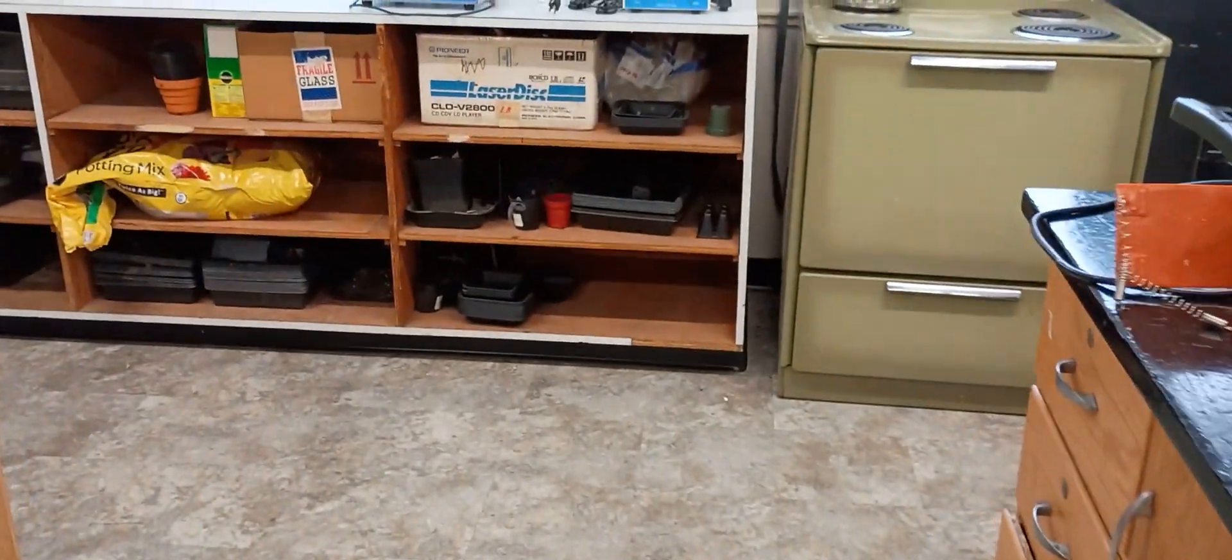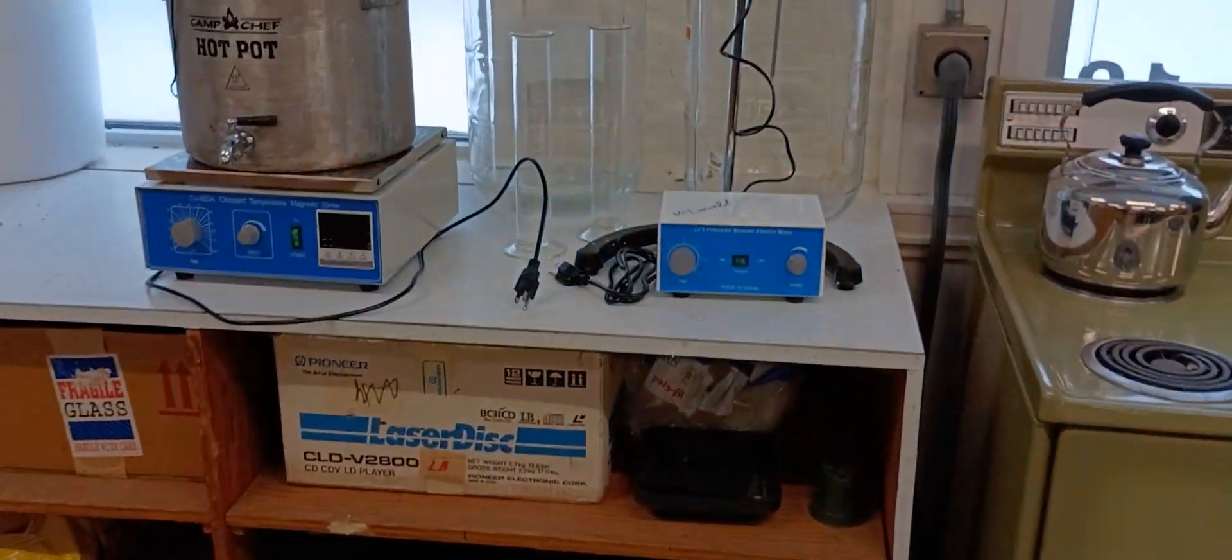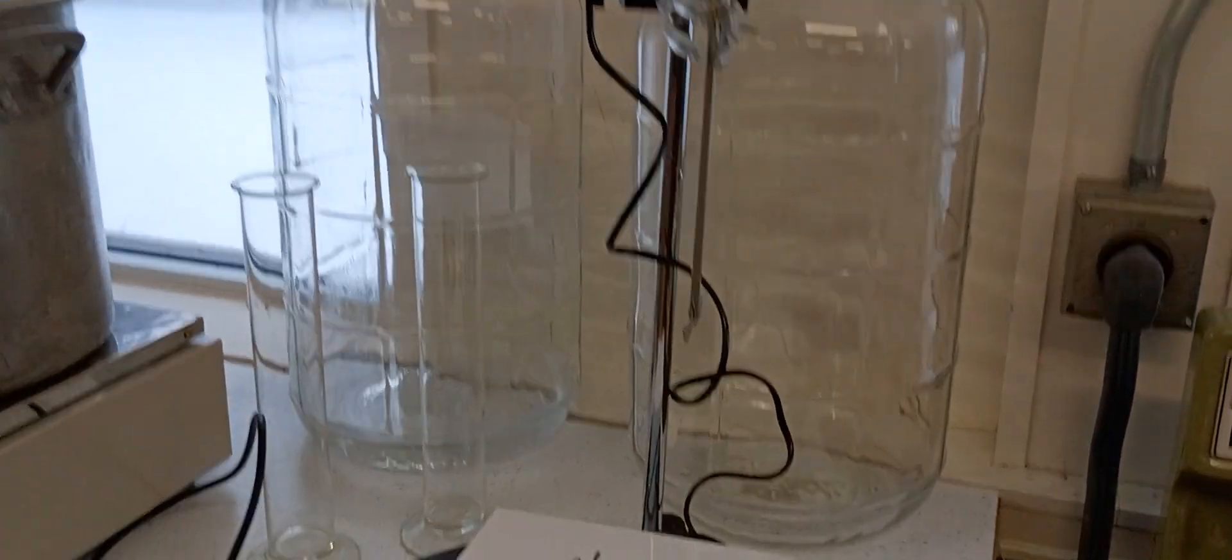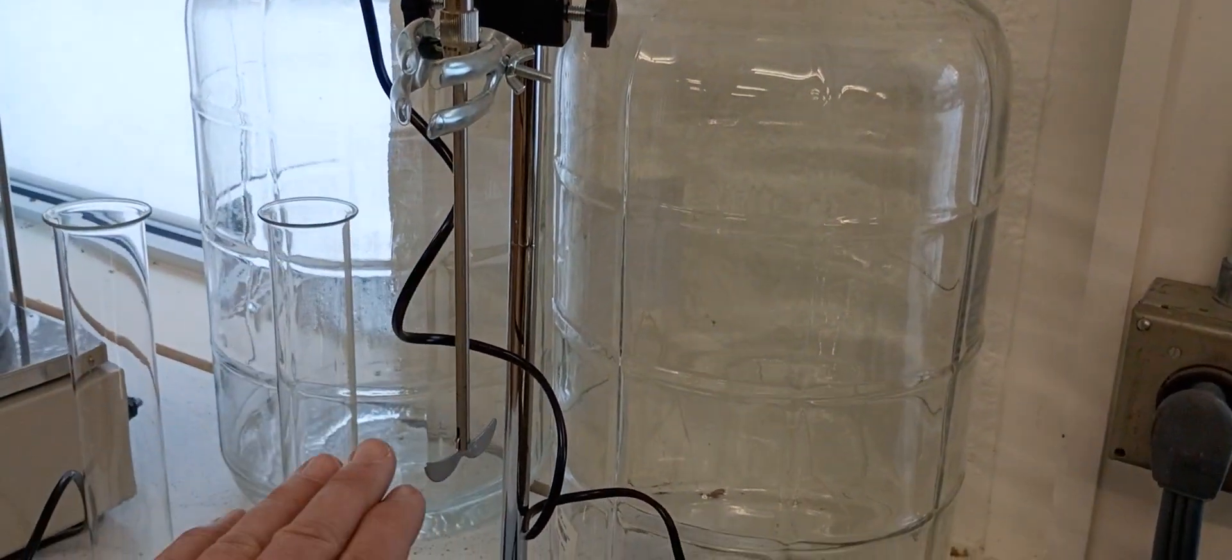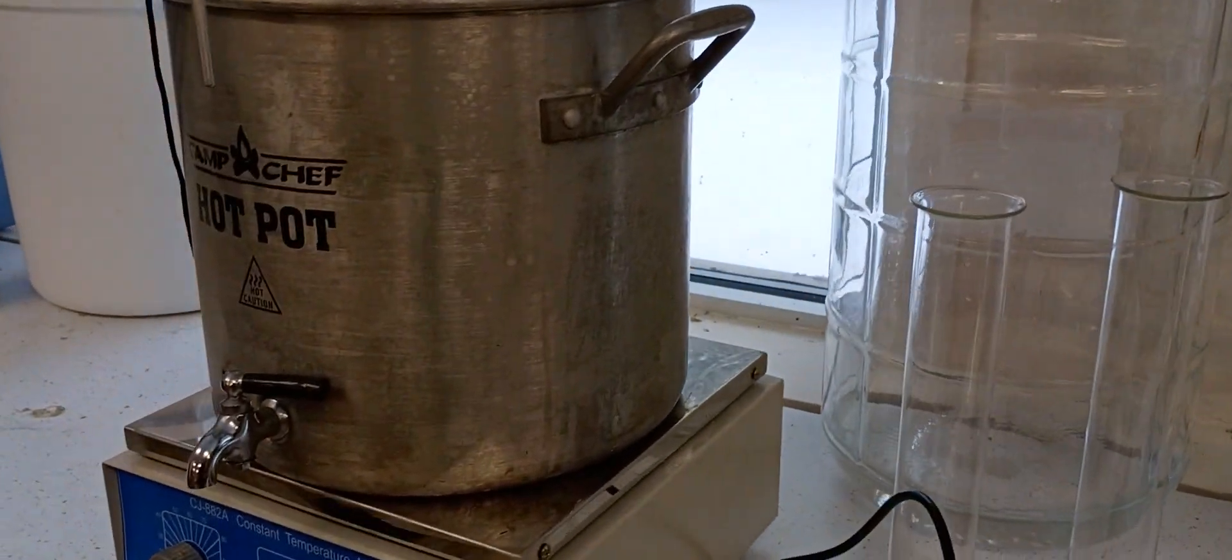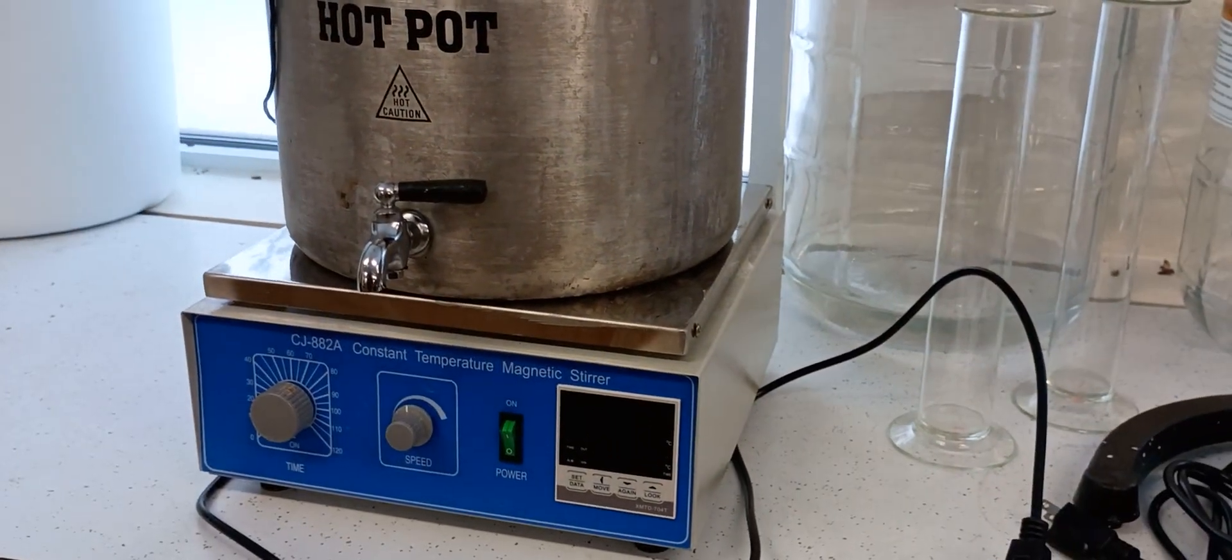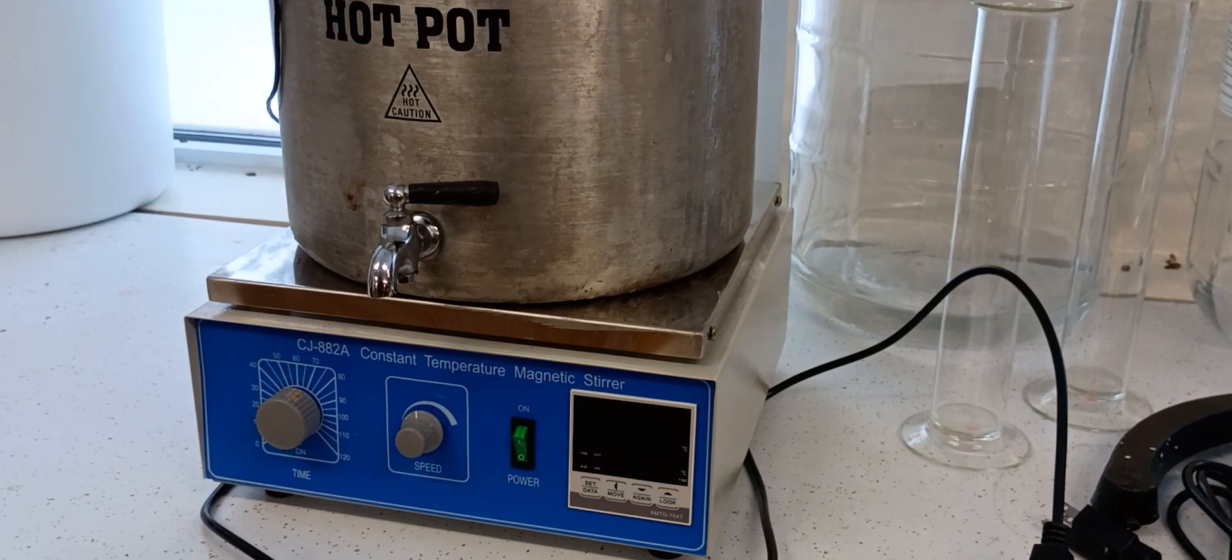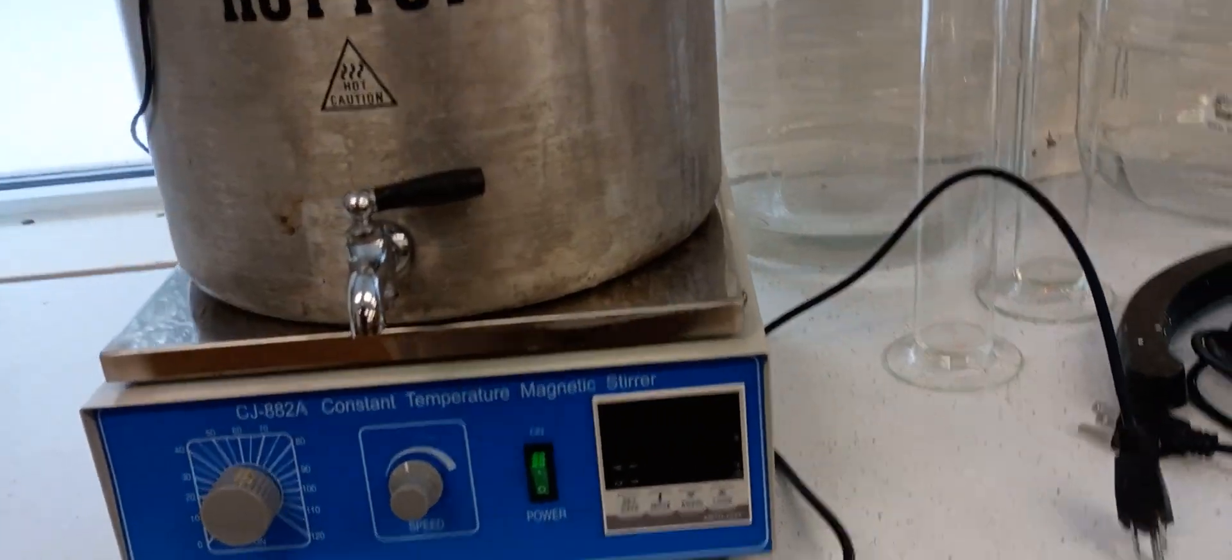So this is the full run right there all in one container. And that is pretty exciting. And I'll take you over here and show you some of the other equipment that we had this time. So we had a stirrer that we were using to be able to mix our material up.